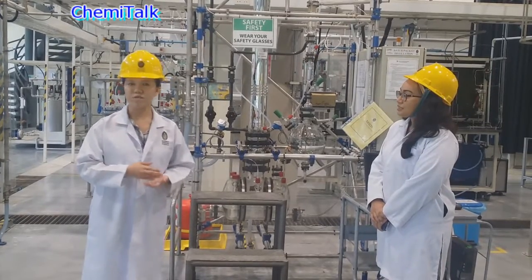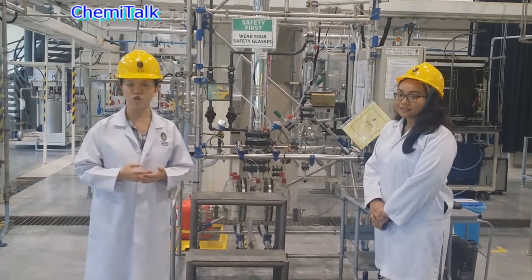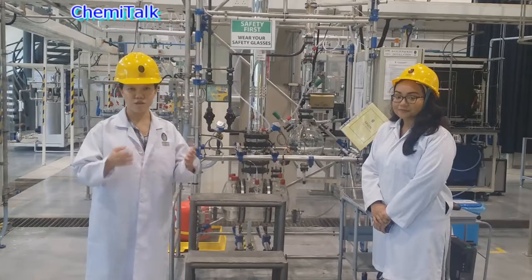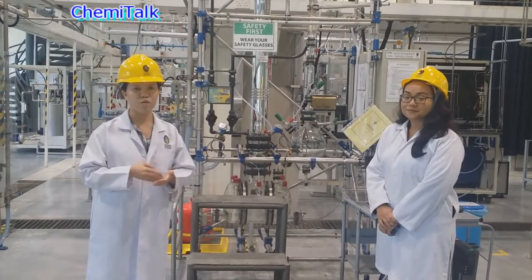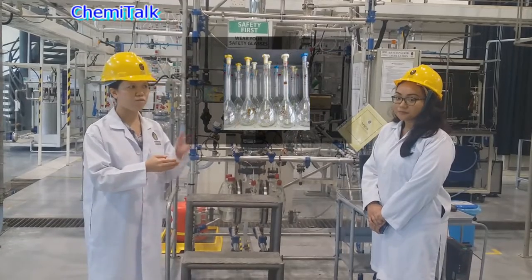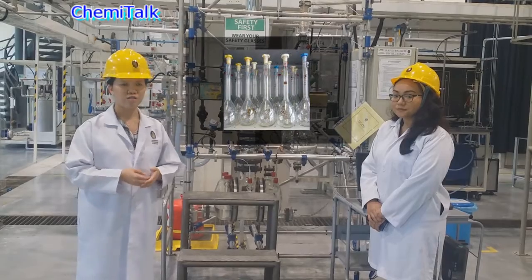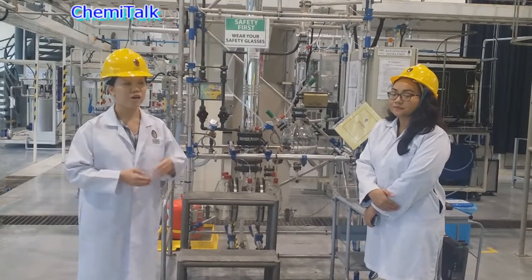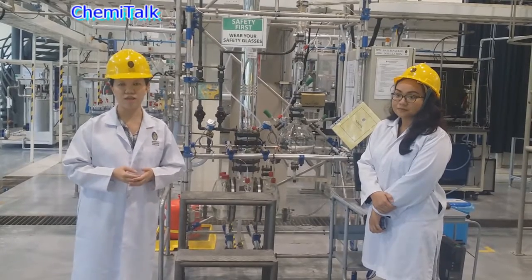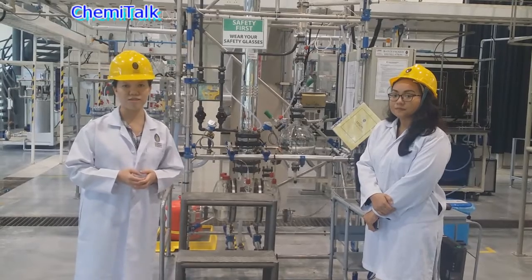Yes, before the real experiment starts, we need to prepare a calibration curve of ethanol water mixtures. We will prepare ethanol water mixtures with different compositions, and then the refractive index of each mixture is measured using the refractometer. After the values are obtained, a graph of refractive index versus the mole fraction of ethanol will be plotted for further use in the experiments.